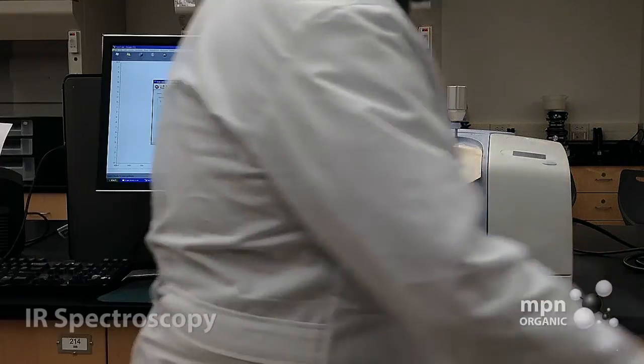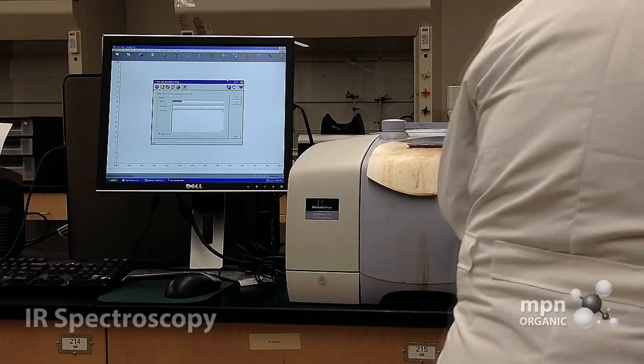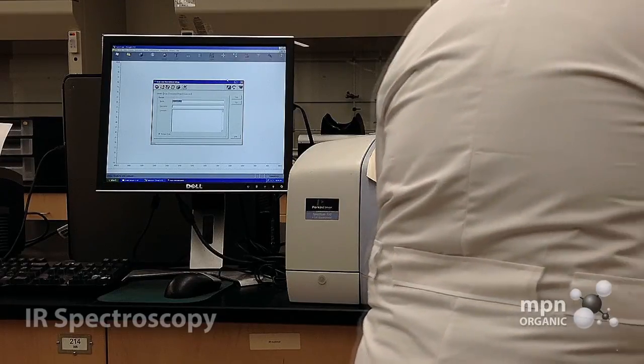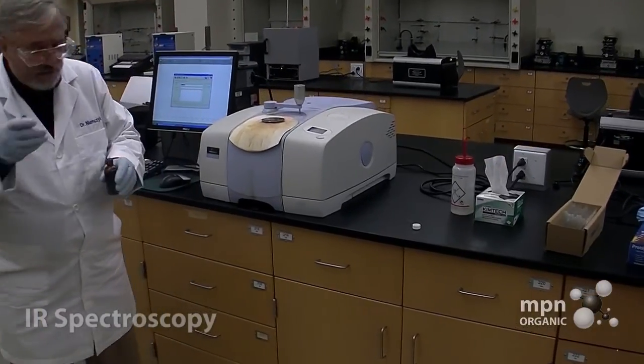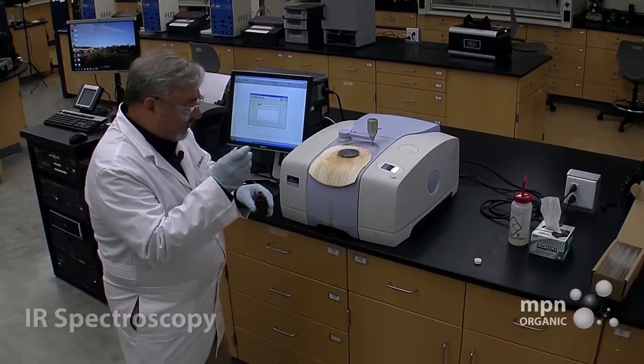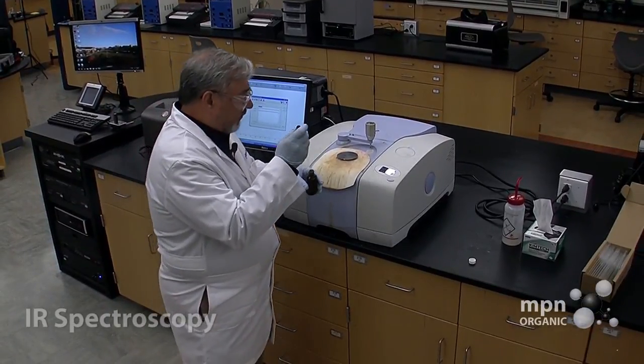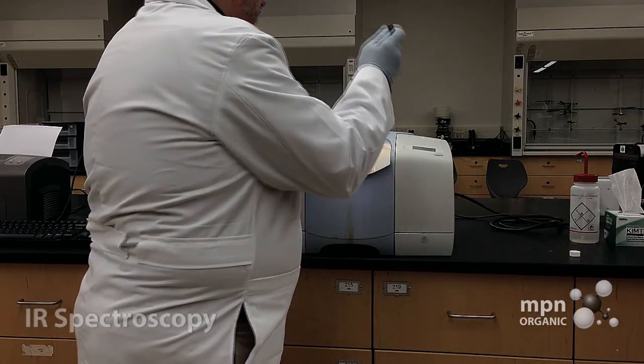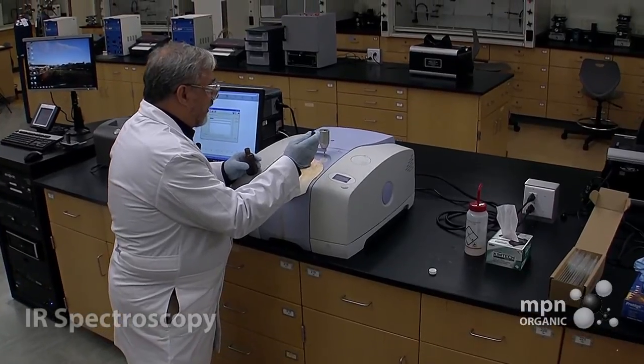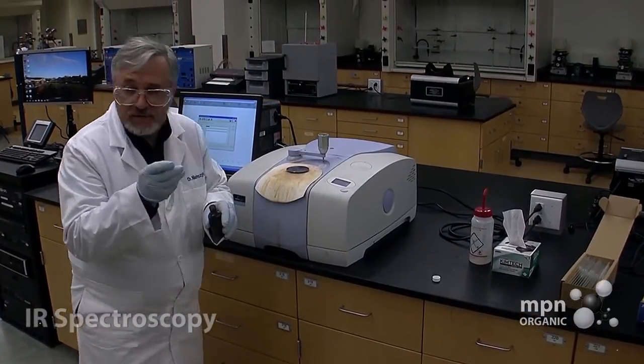And then it's going to come to this particular window. And now we're going to apply the benzaldehyde. I chose benzaldehyde because it is interesting. It has a benzene ring. It has an aldehyde, carbon-oxygen double bond, and it has some other interesting features about it. And I'm going to take my pipette here. I'm going to put just one drop right on that diamond in the center.